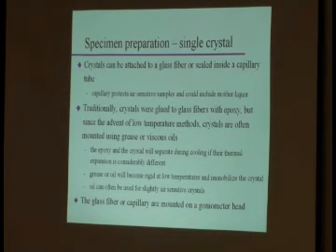So that's an advantage. The problem with the epoxy is, in most cases, the epoxy and your crystal will expand at different rates. So you may be setting your crystal very nicely in epoxy at room temperature, but at low temperature, they don't match anymore. So things break apart where they touch, and your crystal may well fall off that glass fiber. It's pretty useless if you want to do a diffraction experiment on your crystal.